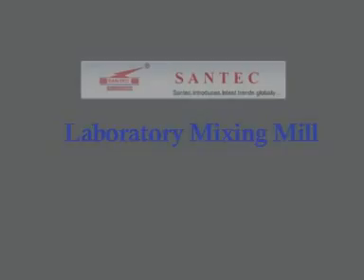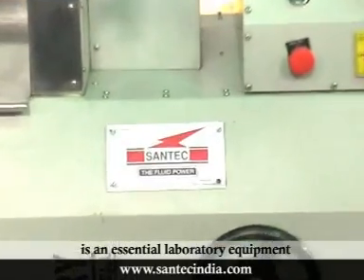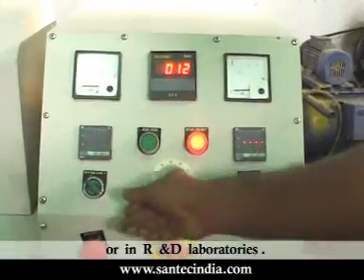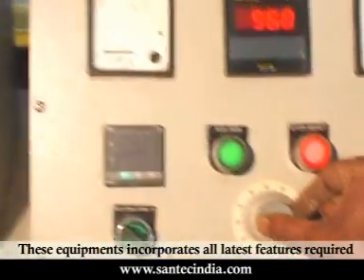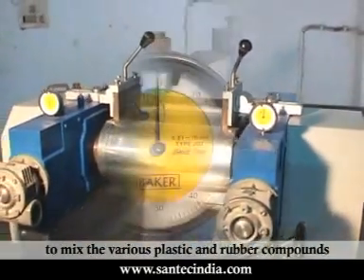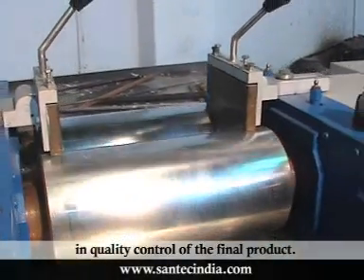Santec Laboratory Mixing Mill is an essential laboratory equipment in the plastic and rubber processing industries or in R&D laboratories. These equipments incorporate all the latest features required to mix various plastic and rubber compounds and play an important role in quality control of the final product.